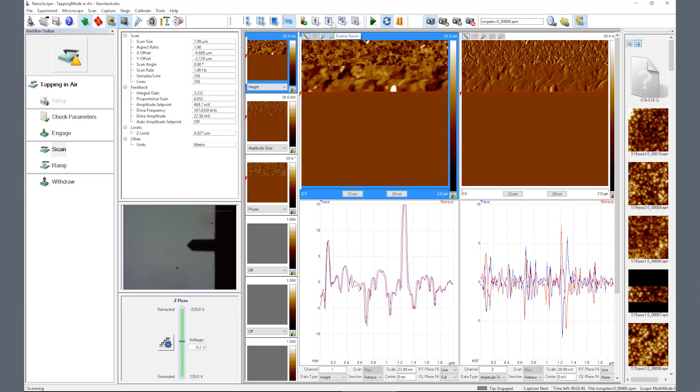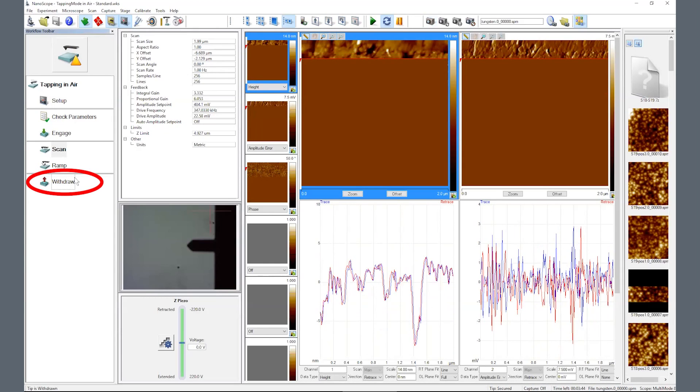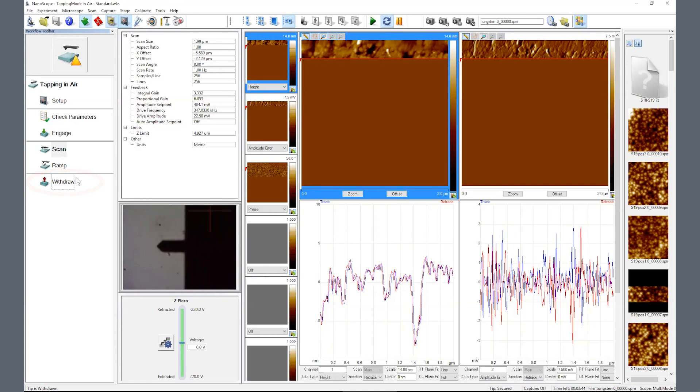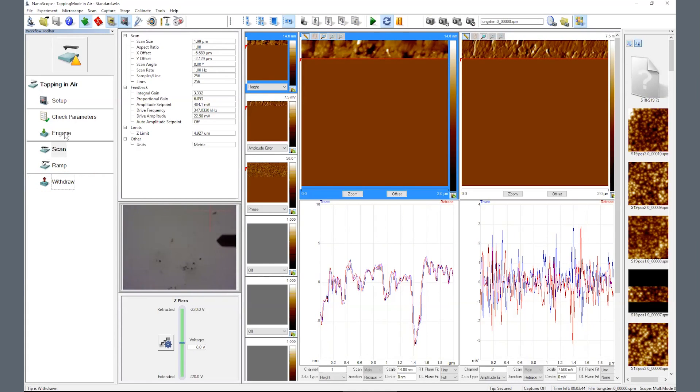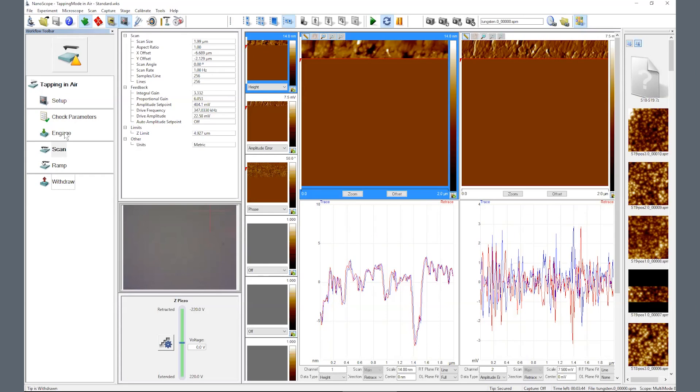Once your imaging is completed, select Withdraw from the workflow toolbar on the left. Then hold the up position on the microscope base for about 3 seconds to increase the physical distance between the probe and the sample. Remove the probe from the optical head, remove the sample, and close the nanoscope software.